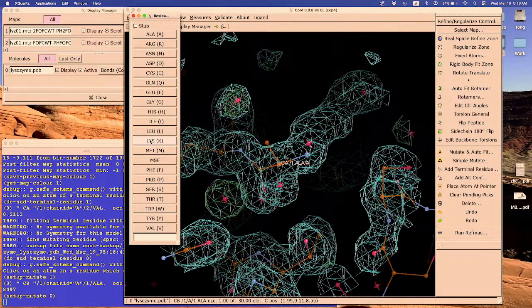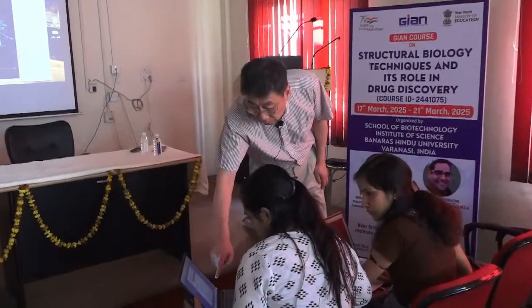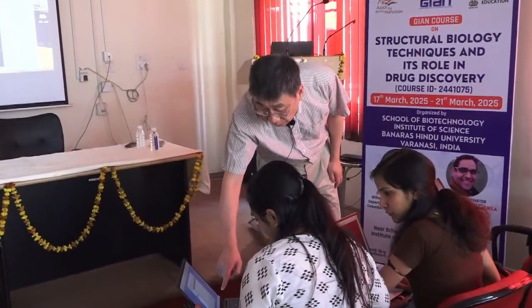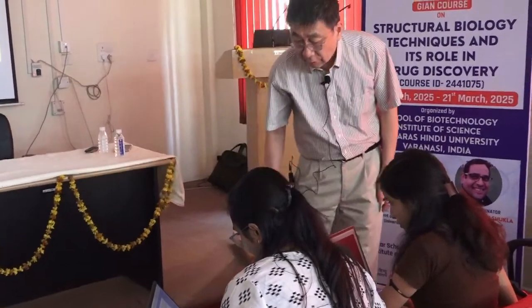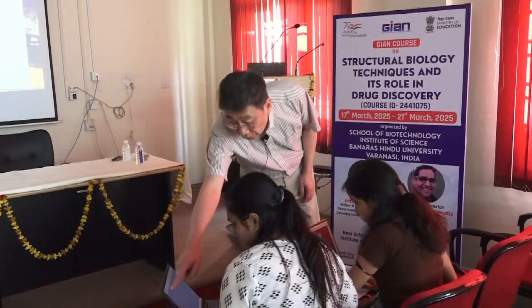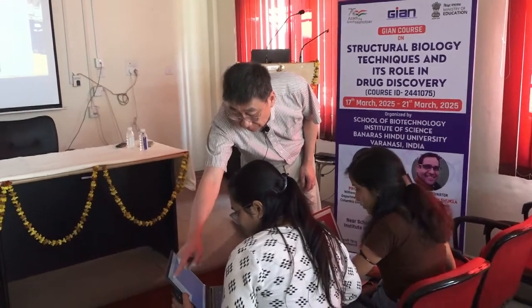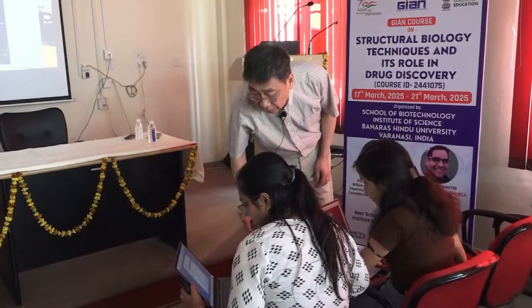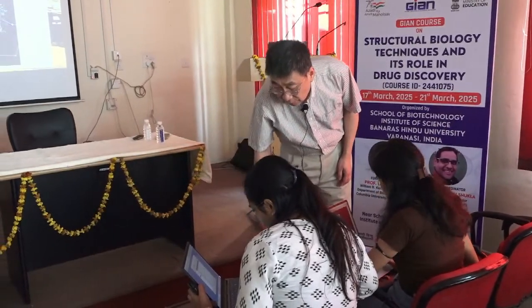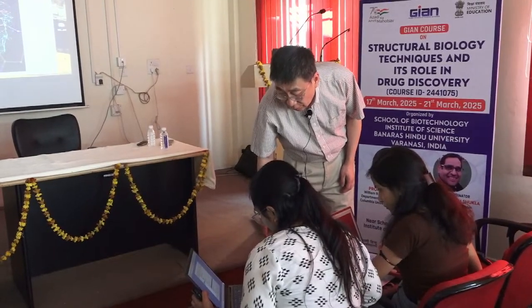So that's a file. Open, auto open MTZ. Did you do auto? Yeah, that one. Say OK. No, file. No, this one. File, under file. Auto open MTZ. Yeah, right. There you go. MTZ. Yeah. And say OK.